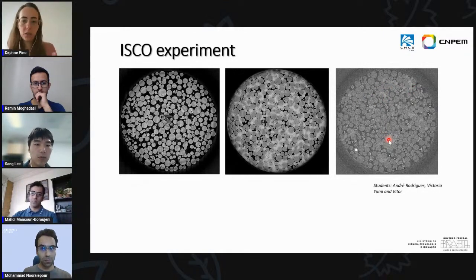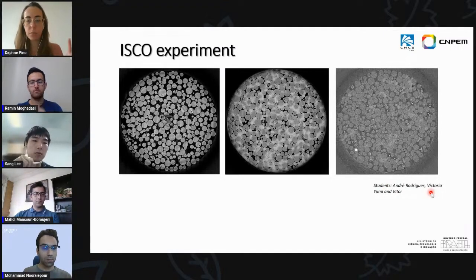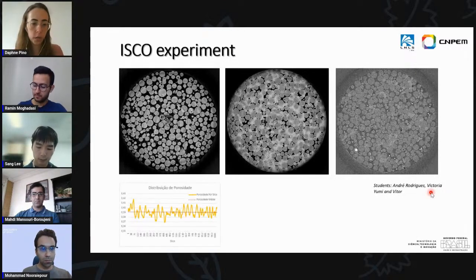This is still an ongoing experiment because we have students working on this, and we're still working on what's happening here. But one of the interesting things is that we saw very important variations of pressure in our system. So we're investigating these reactions, what is causing this variation of pressures, because this could be very significant depending on what you're doing during field work. And we can do the same kind of analysis of distribution of porosity and permeability here.